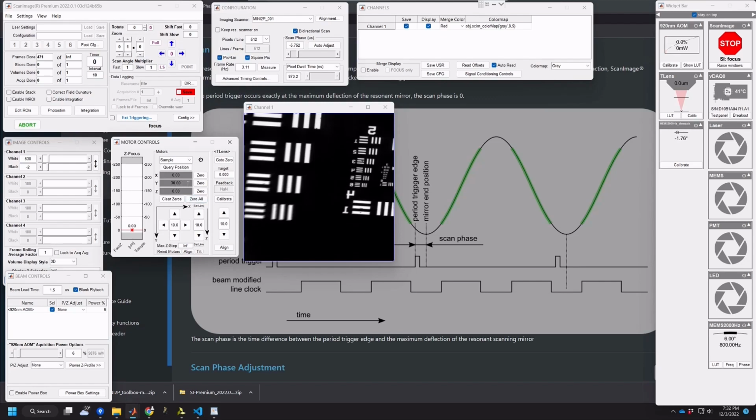And this should reflect the position in these sample coordinates. So there are sample coordinates and raw motor coordinates. Raw motor coordinates should correspond to what the controller says the position is, and the sample coordinates can be zeroed at any time whenever you're at a location of interest, where this should be the center of the sample coordinate system. You can zero at any time and then measure relative to that.